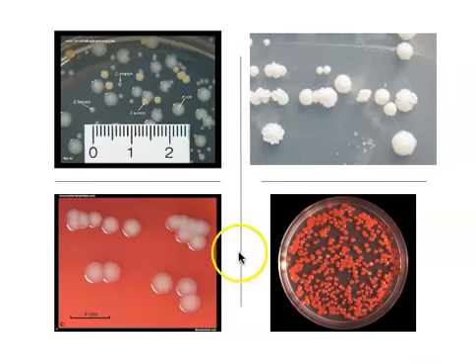So you can purchase sheep blood from chemical supply houses, and it can be added into the agar, giving it this red color. Remember, anytime we add an ingredient like blood or serum or milk or eggs or meat, we are creating an undefined medium. We don't exactly know all of the molecules that are present in blood. We just know that lots and lots of bacteria will use it as a food source.